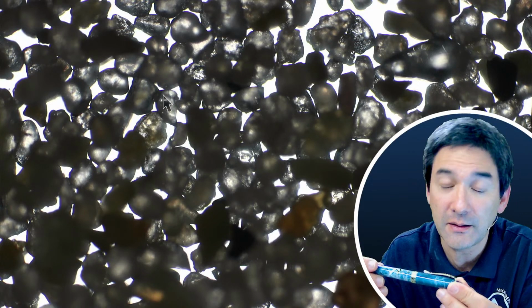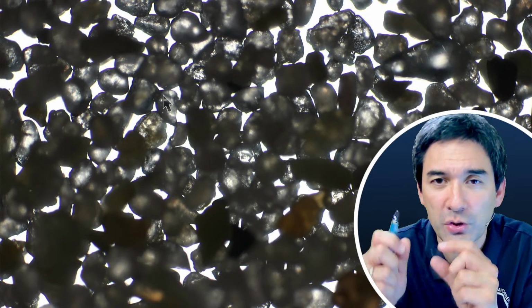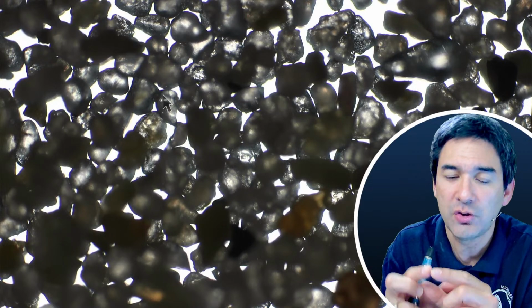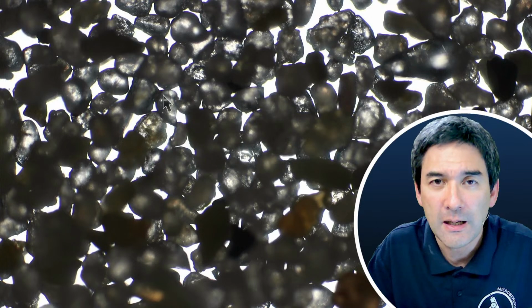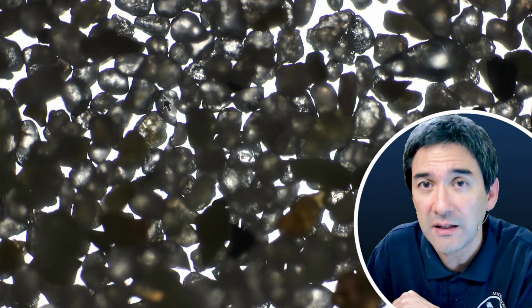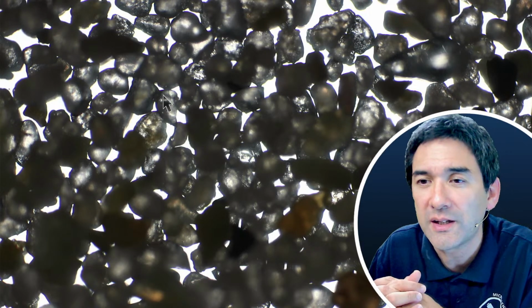As a matter of fact, some months ago, you got to check this channel or the other one, I actually put some insects under the microscope, and those were gigantic beetles and insects that were actually preserved in this epoxy resin. And you basically just take it as it is, and then you put it directly under the microscope. So yes, I think this should be possible. I've not tried it yet, but that is indeed something that I've also been thinking about. But I don't have experience actually making these epoxy objects.